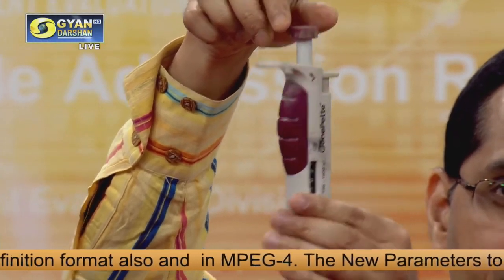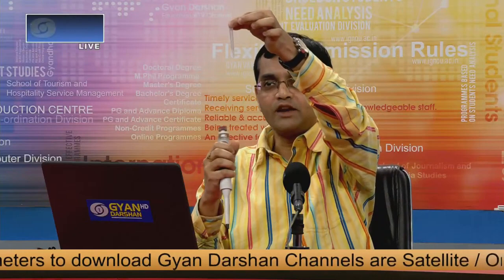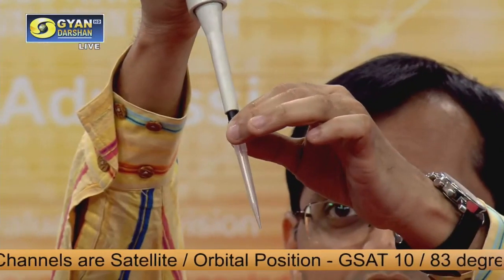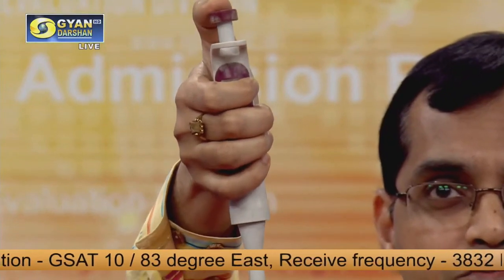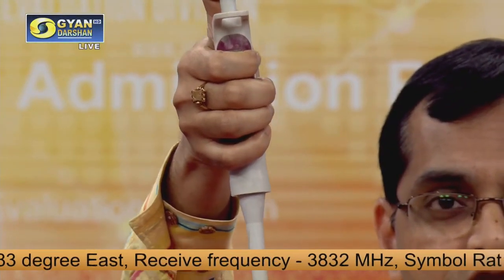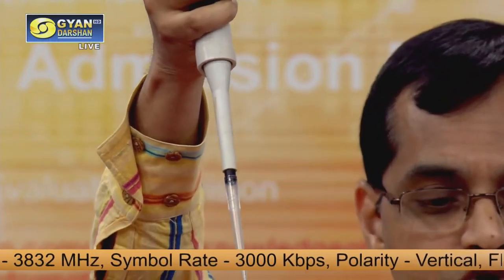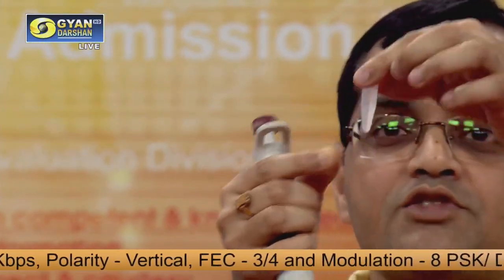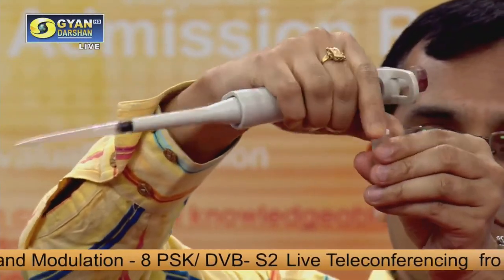There are different types of pipettes. This is one of the pipettes which you are using. And these are called the micro tips. You can attach a micro tip like this, and here you have to press it gently so that you can actually pipette out some liquid. I am showing you how to use it. Like this is the Eppendorf tube. Let's say there is a particular solution here and you open the tube like this.